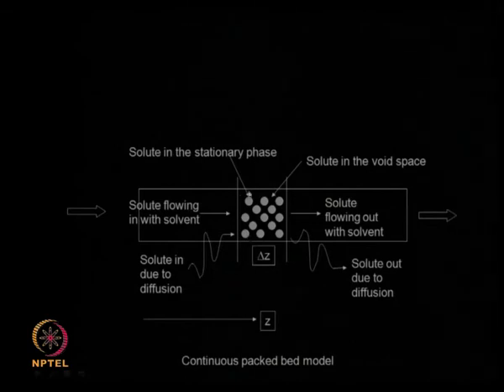Okay. So, the buildup of concentration of a solute in this region will be equal to the solute flowing in through the solvent, solute flowing in because of diffusion minus solute flowing out with the solvent minus solute flowing out due to diffusion. So, if you are interested in using a packed bed type of approach, then this is how you do the modeling. So, what terms will come? Flow rates will come into picture, diffusion coefficient will come into picture. Okay.